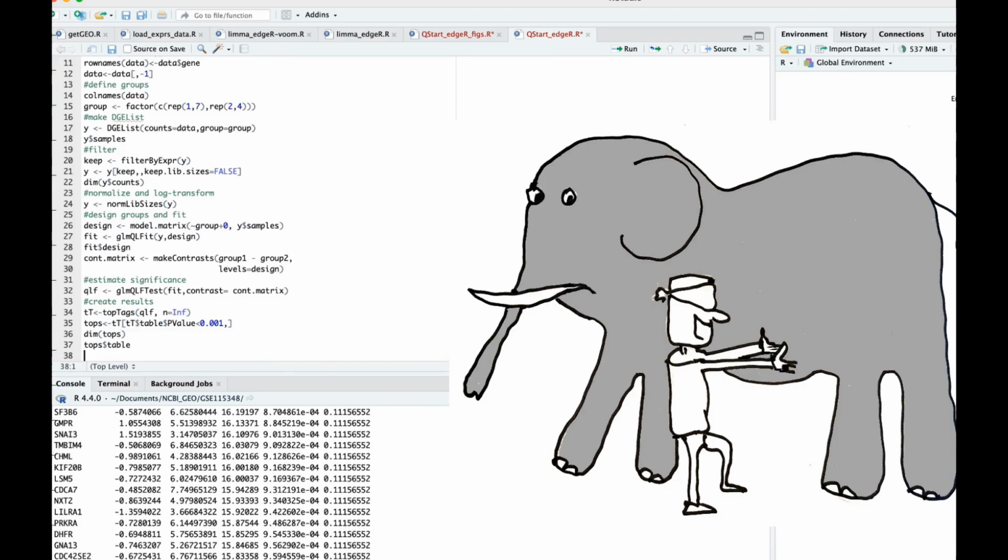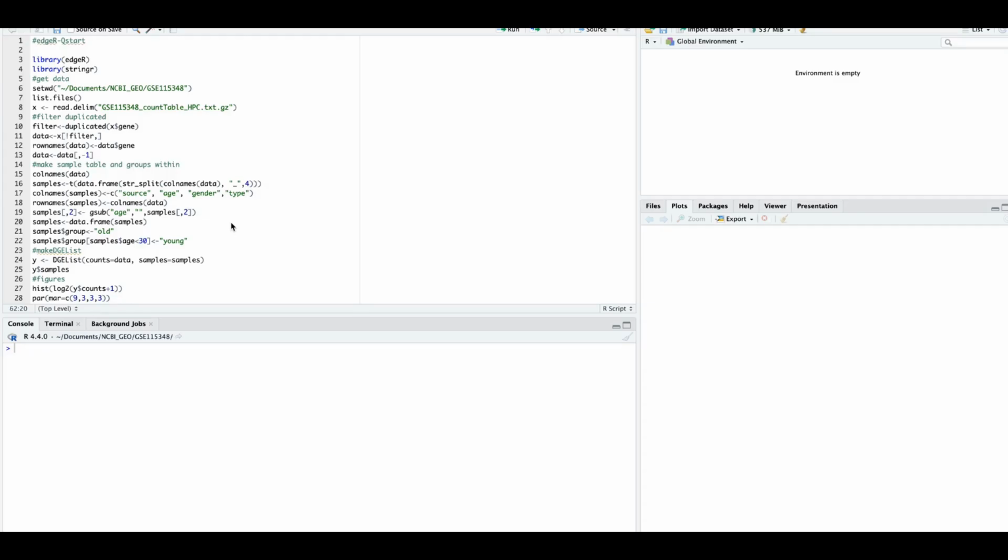It looks like the script works well and we got the results, but doing it without illustrations carries a danger. We might miss an elephant in the room. Let's now do it again with the figures and see how it will change our opinion about this dataset.